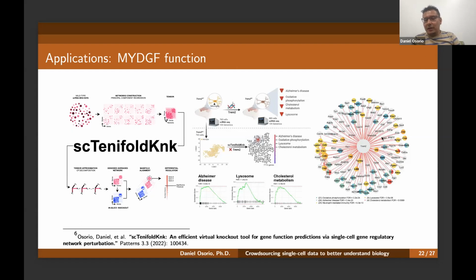This plot, what I call a peacock plot, is colored based on the function identified in here. So microglia is known to be associated with immunity, and all the other phenotypes or specific biological processes in here were recovered by the original authors.